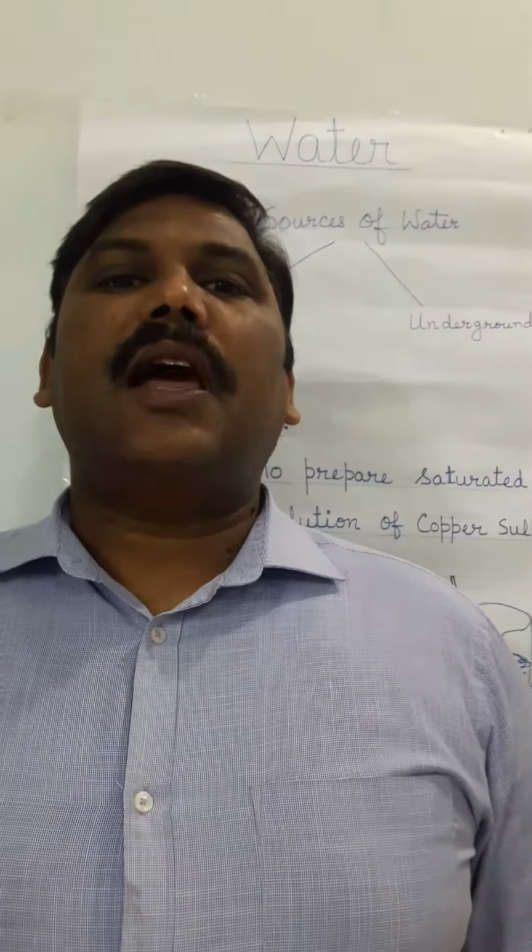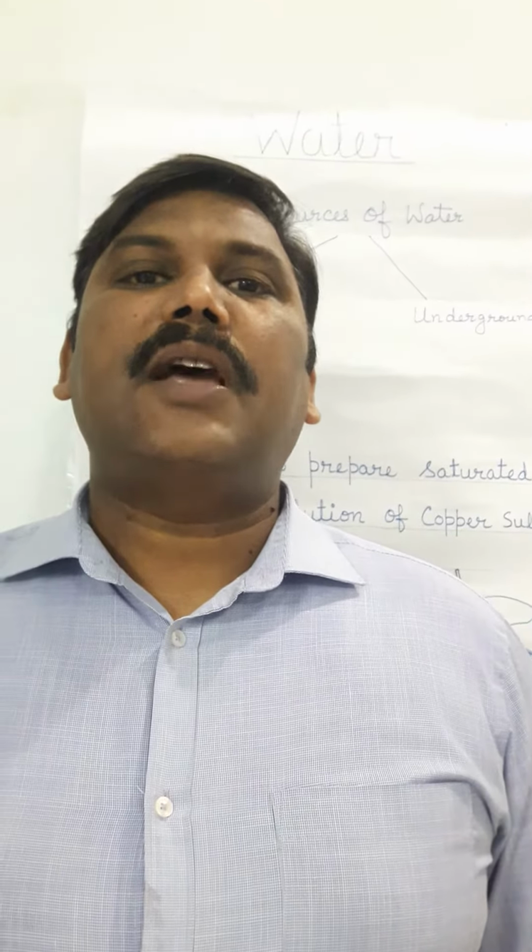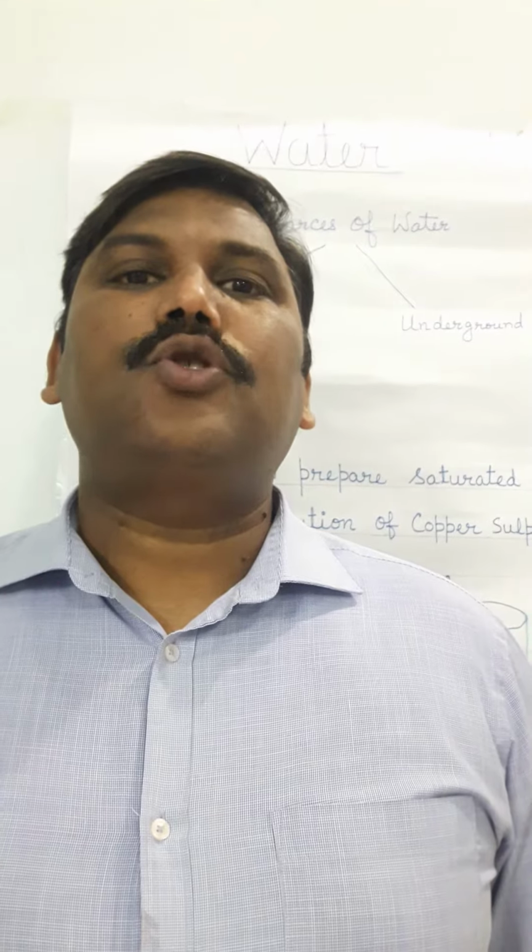Today we will discuss an activity. In this activity we will learn how to prepare a saturated solution of copper sulphate at room temperature and to observe the effect of temperature on its solubility.